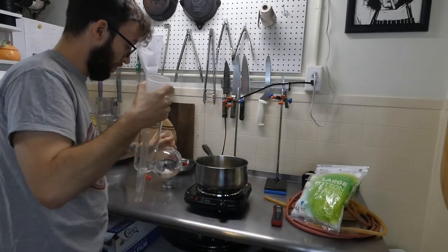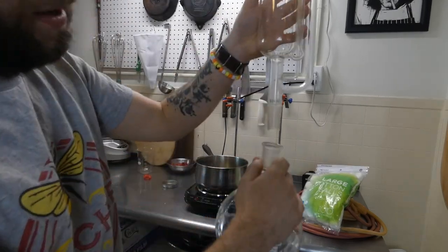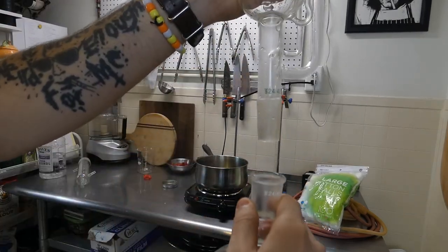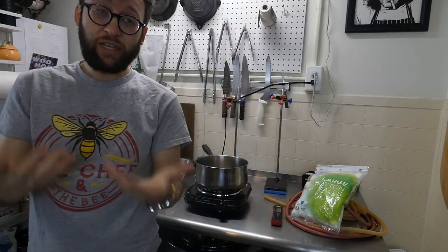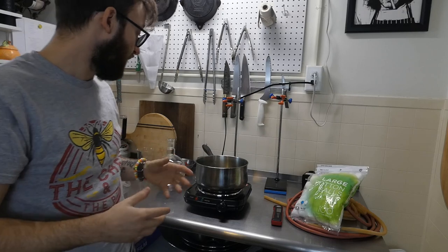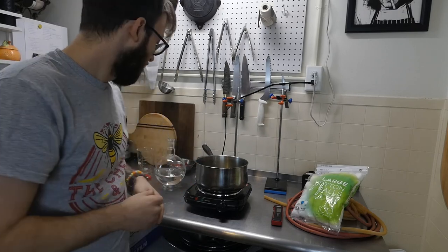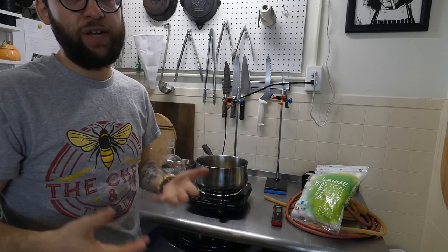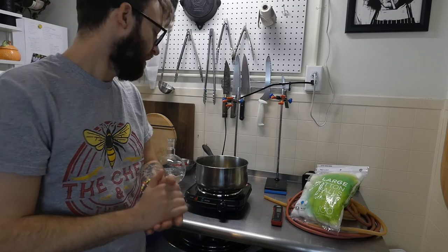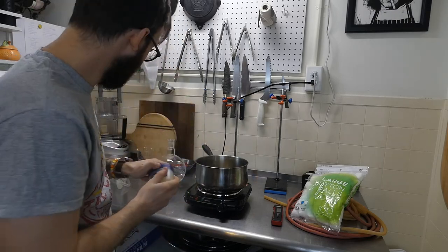Now, the cool thing about this is when there's two joints that are the same, you can take them and fit them right into the other one. However, when you're doing extractions, there's always a chance that those ground joints will get stuck, and that's called a frozen joint. When that happens, it's very hard to remove it without actually breaking the glass. There are methods to do that, but let's just play it safe and rub a little Vaseline on the joint.